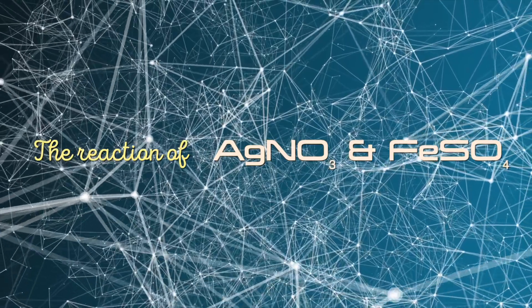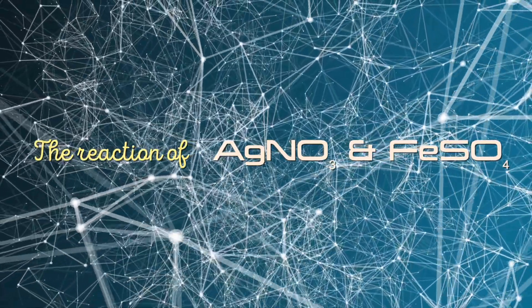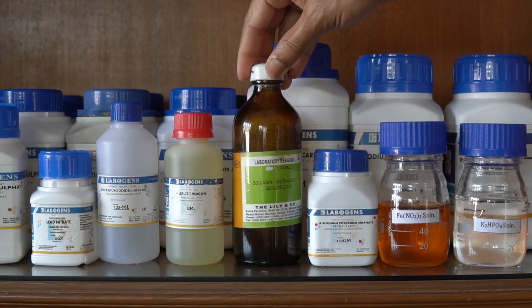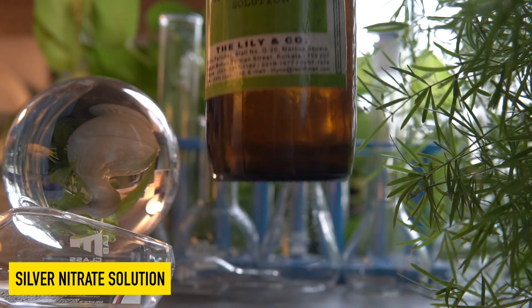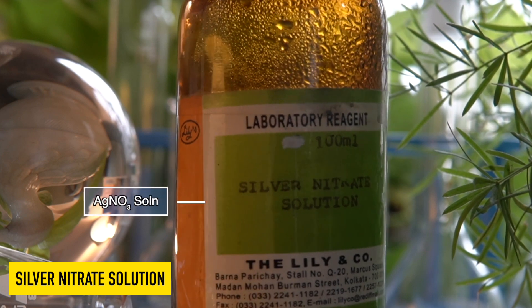Today we are going to observe the chemical reaction between silver nitrate and iron 2 sulfate. This is silver nitrate solution, a transparent liquid.